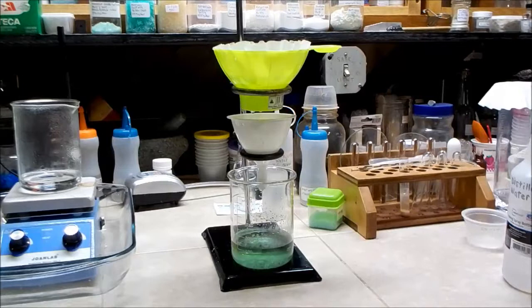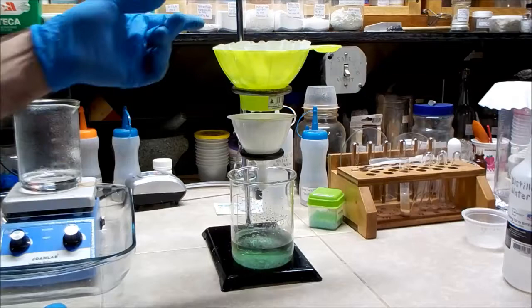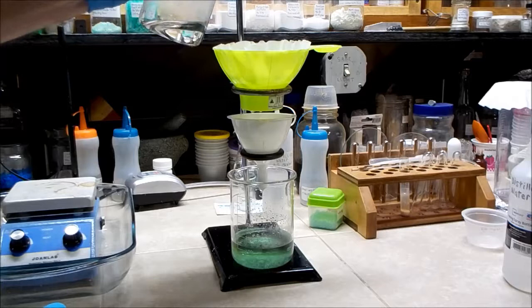So my filtering has gotten really slow, and I can see some crystals already forming in the bottom of the beaker. What I think is happening is that it's crystallizing in the filter paper and clogging it up. So I'm going to add 50 milliliters of boiling water. That should help get it going again.